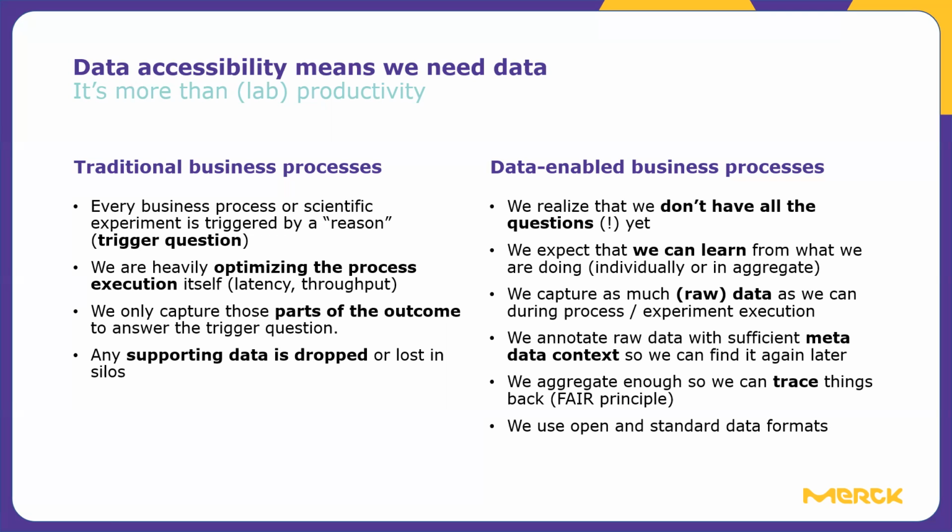And we may be able to aggregate the data as well. And we do that enough so we can trace things back. And we use open and standard data formats in order to ensure the interoperability. And that will then allow us the reuse of the data. And you may know these concepts under the term of the FAIR principle.